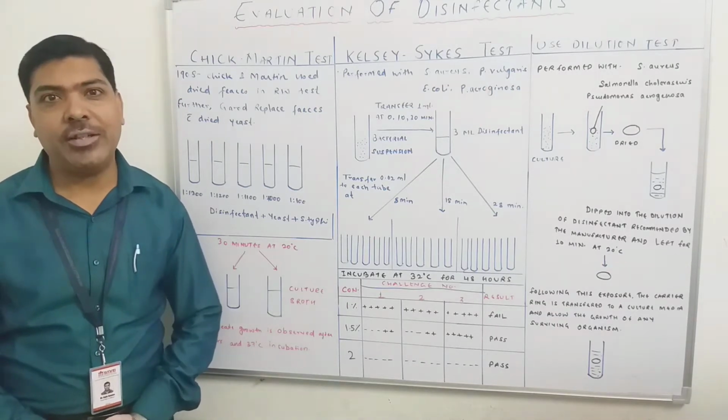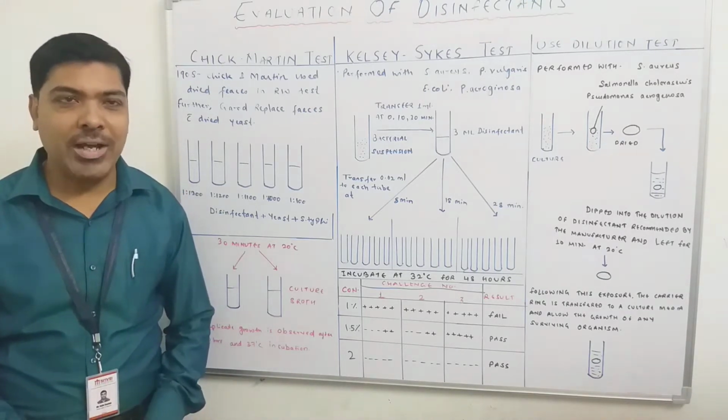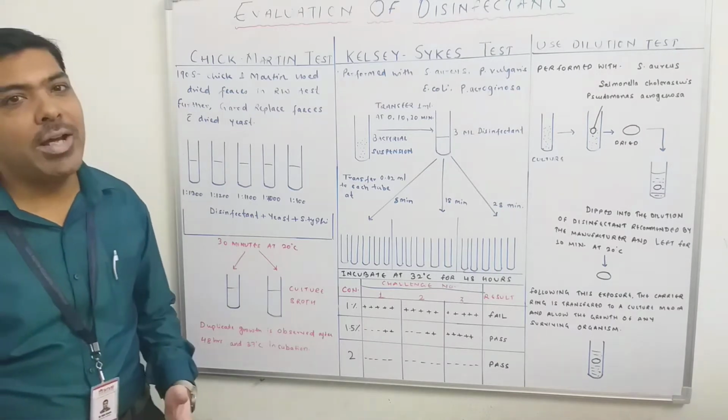In today's video lecture, we'll discuss the evaluation of a disinfectant by the Chick-Martin test, by the Kelsey-Sykes test, and third, by the use-dilution test.